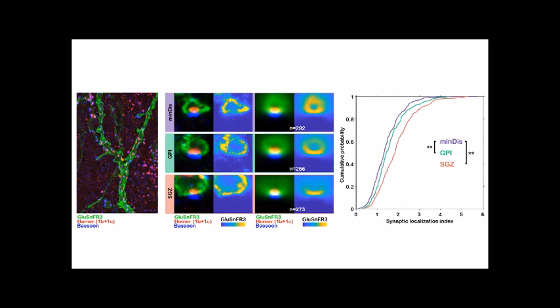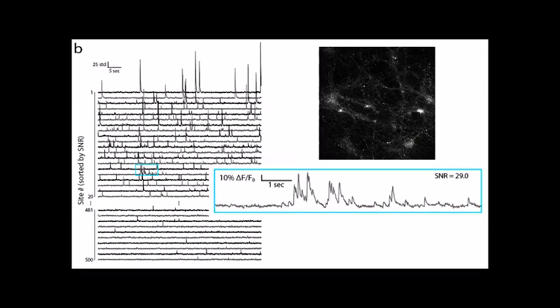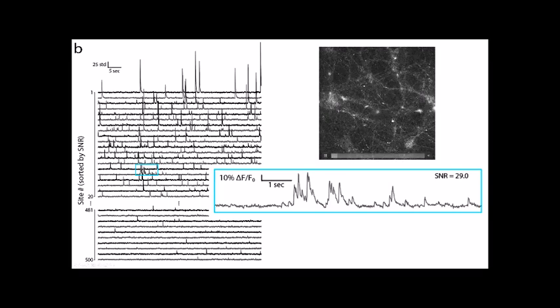That's a very insightful question, actually, because when we image these optical minis, both axons and dendrites are labeled, right? And so we're not going to be as sensitive, for example, to postsynaptic localization as if we had somehow only labeled postsynapses.